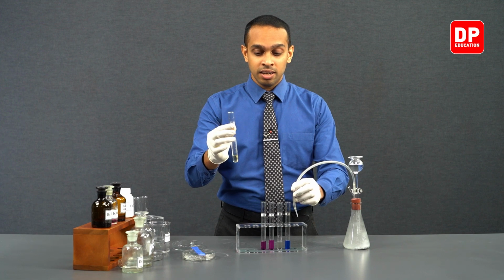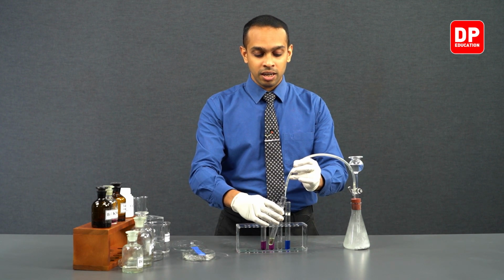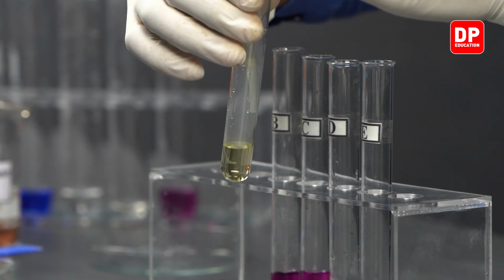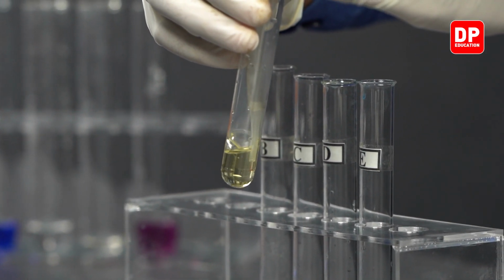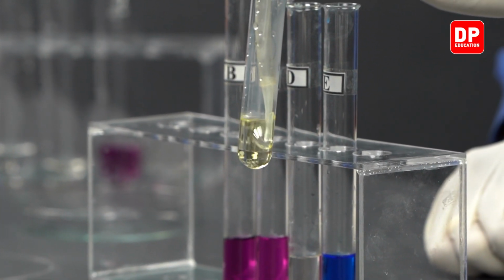Let's first take our bromine water and observe if there is a color change when acetylene gas comes into contact with bromine water.